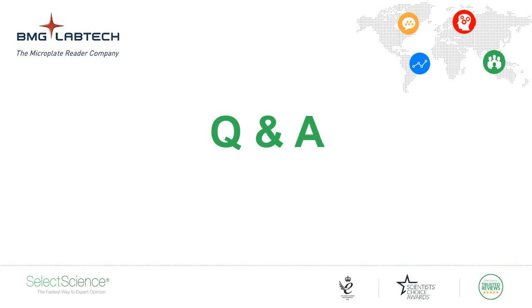Thank you very much. We just have time for one more question, which is, what kinetic analysis calculations can be done in the PHERAstar software? Well, we might both be able to answer this. The PHERAstar can use Michaelis-Menten, Lineweaver-Burk, a whole variety of different analysis plots, basically, if you like. KM, Vmax can be obtained from the system. So I think that's things your team are investigating at the moment, isn't it? More usability of the software.